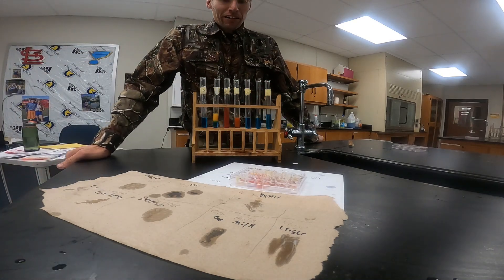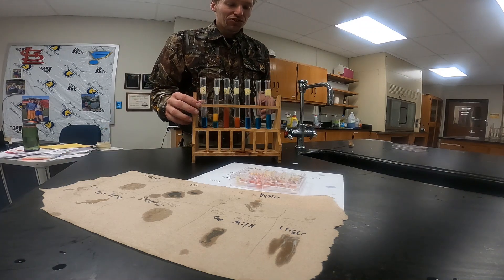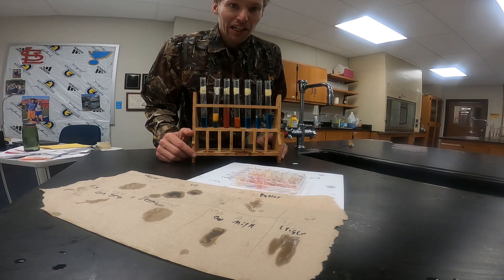Hopefully you were able to identify the macromolecules found in the different foods. If you need to go back and pick up what color change we had in each one of those tests, go right ahead. We'll get everything cleaned up and you have a great day.